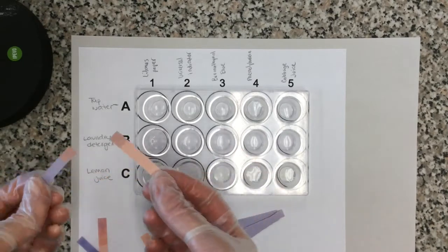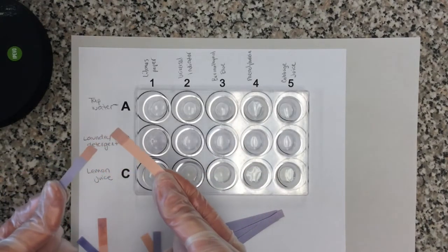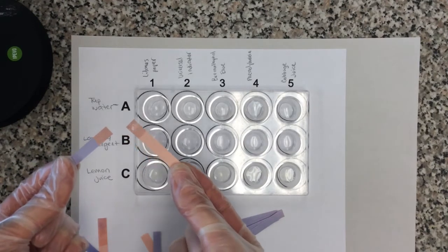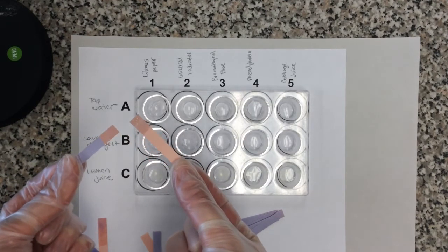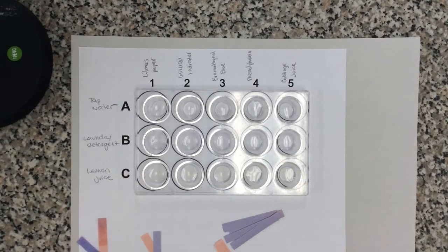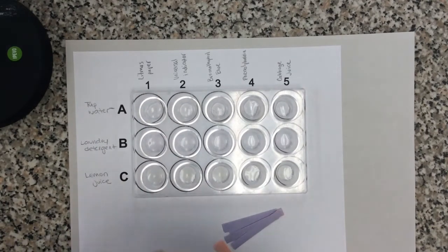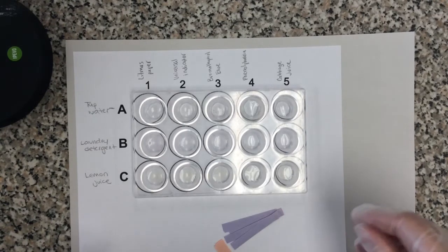Oh. And for lemon juice, it turned red with my blue litmus paper and it stayed red with my red litmus paper. Okay. All right, so now that you have those tests, those columns should be complete for you.